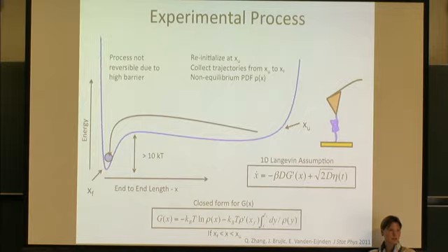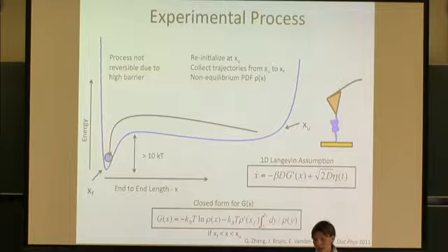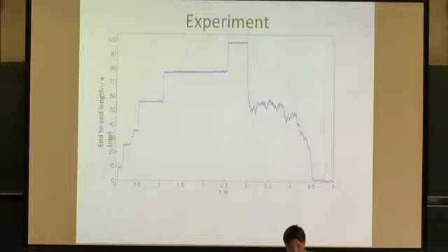So it's like a trick. It's a clever trick to reweight what you measure to get it back into the equilibrium measurement. And so it's a neat tool because now we can go back to the data and we can measure this, and we can then estimate the g of x purely from the data. So how do we do that?